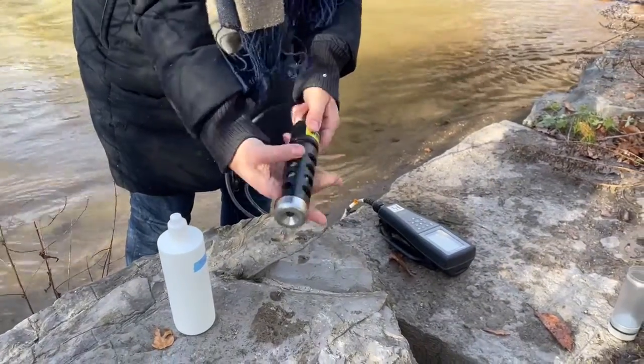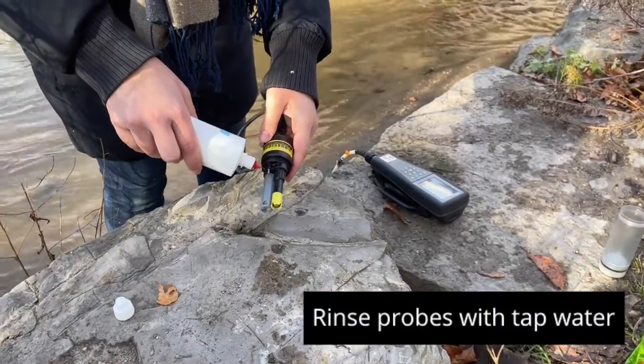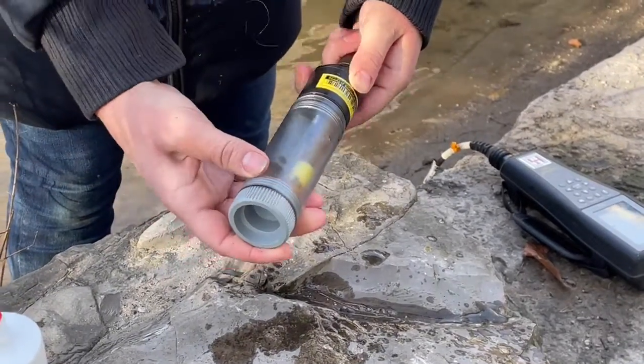Once the values have stabilized, you'll see an AS beside the value. When you're done, take off the YSI cage and rinse the probes off with tap water — never distilled water. Thoroughly rinse all the probes and then shake them to remove excess water droplets before putting the plastic protective sleeve back on.